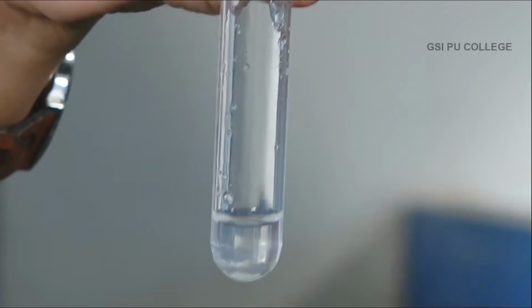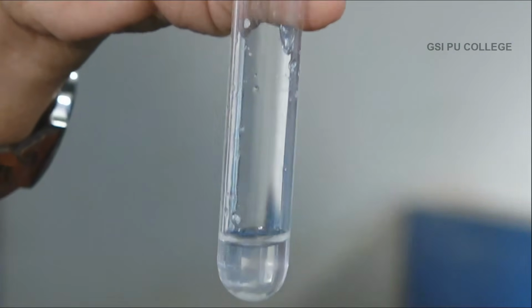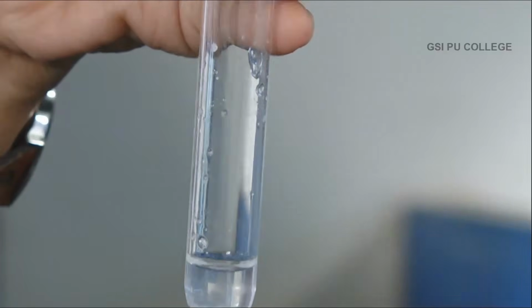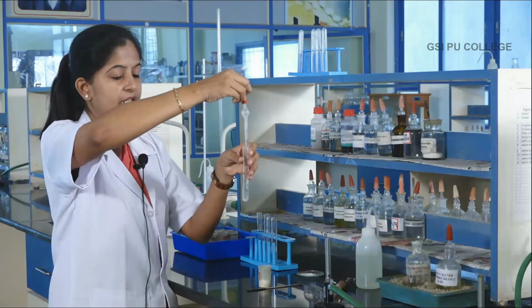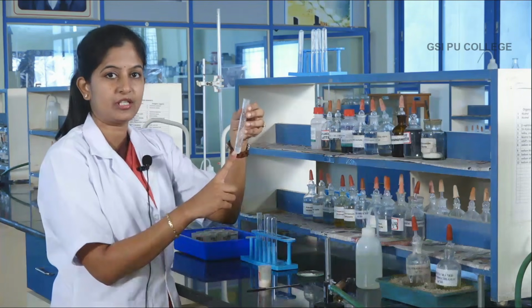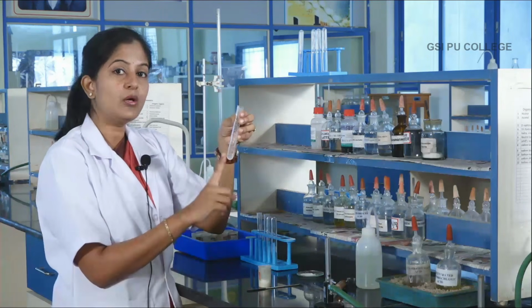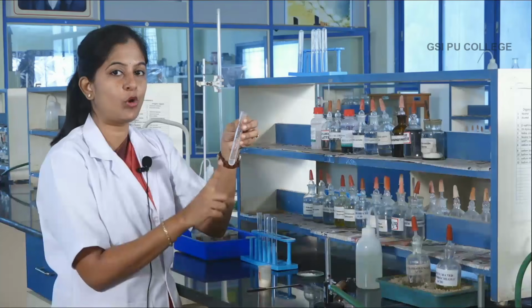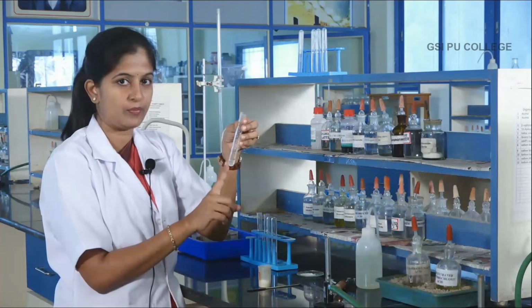Since it is absent, now we move on to second group acid radicals, to detect whether they are present. Take a pinch of salt, add concentrated sulfuric acid. You can observe there are no characteristic reactions upon adding concentrated sulfuric acid. Chloride and bromide are absent, since chloride and bromide react at room temperature to give their characteristic reaction. Since there is no characteristic reaction at room temperature, chloride and bromide are absent.